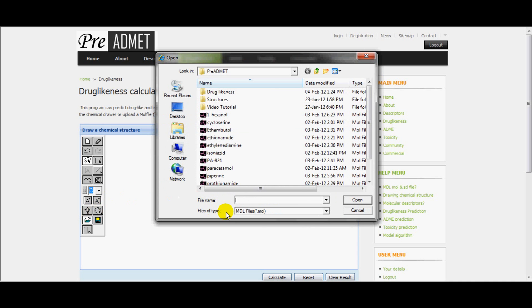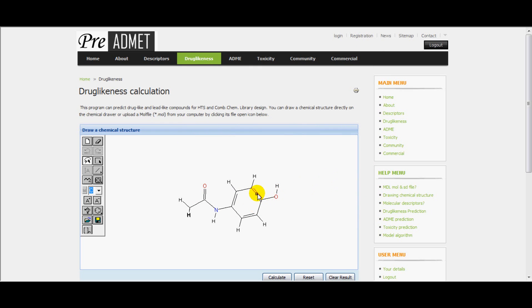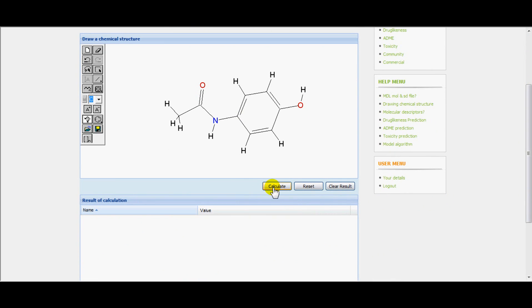Here you can draw the structure of your molecule in the drawing panel. Let us take an example very commonly used in our daily life: Paracetamol. Paracetamol, also known as 4-acetamidophenol, which is used as analgesic and antipyretic. Let us open already saved mole file of Paracetamol. You can rotate the molecule to view all the atoms.